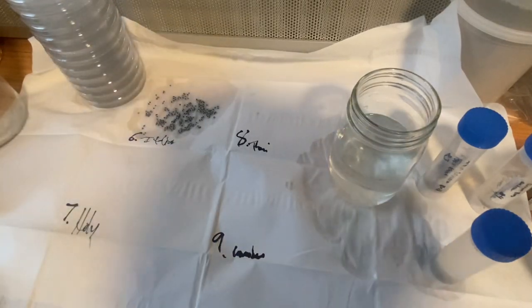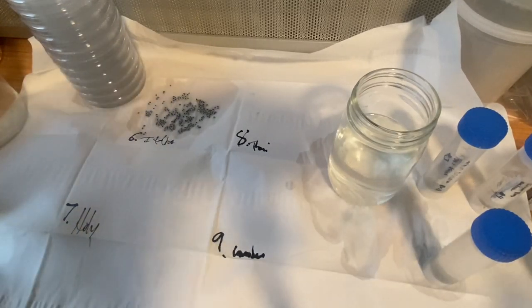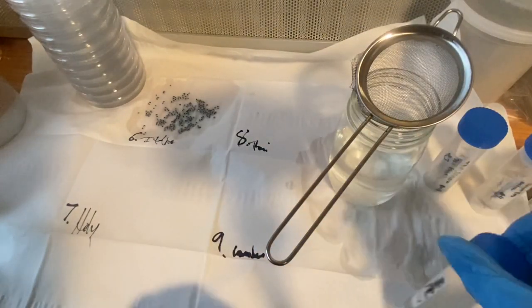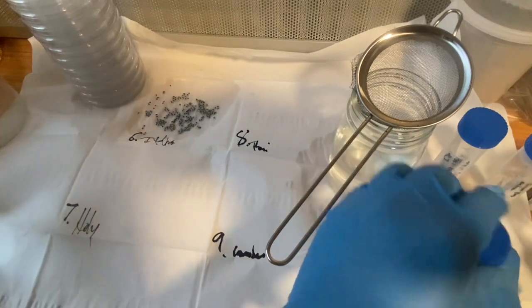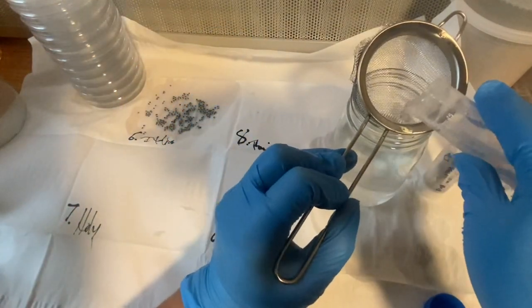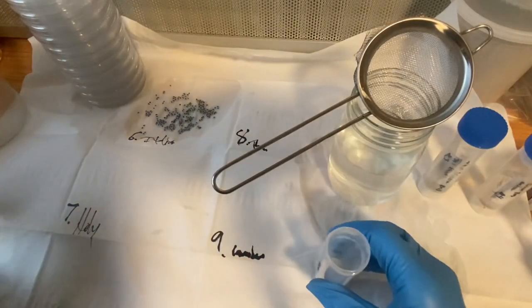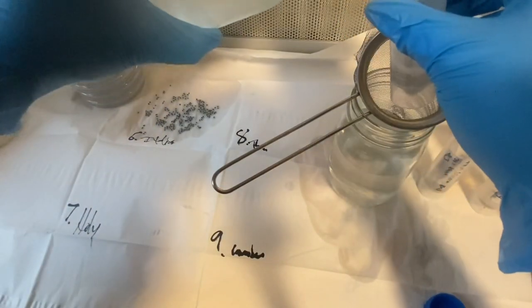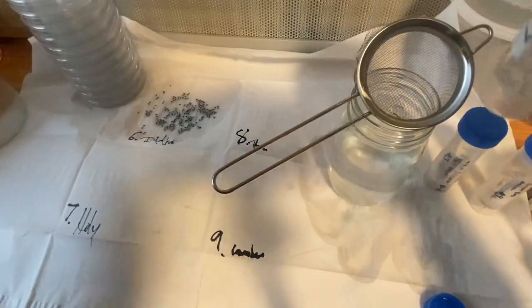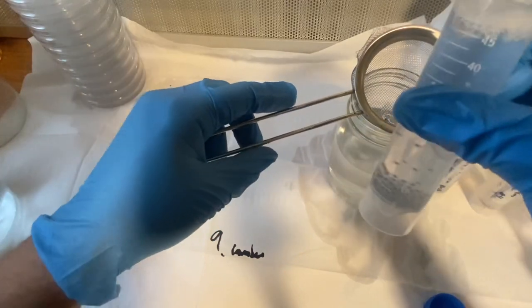Cleaning off my strainer. Sorry about that. All right. Fresh and clean. Ready for the next one. This is the holy basil. So again, let's rinse off all that bleach. This one was actually a lot easier to just kind of fill and rinse. Let that settle.